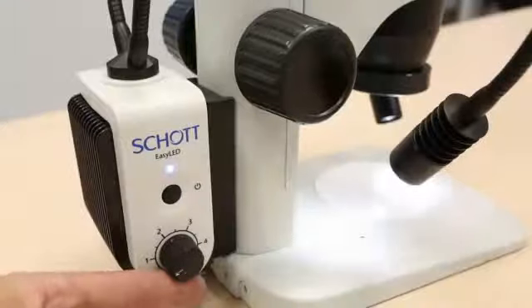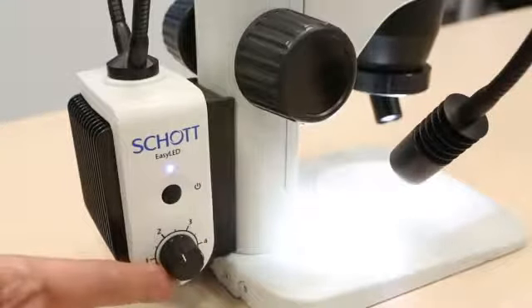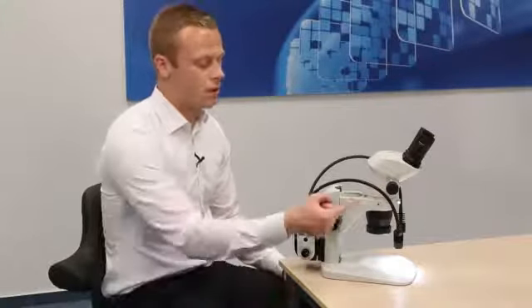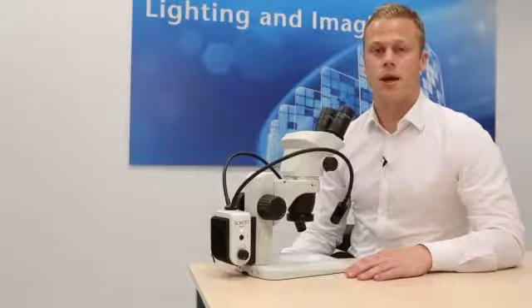You may adjust the brightness anywhere between a scale of 0 to 5, with 5 being the maximum intensity level at up to 140 lumens per head, as you can see here via the flexible gooseneck. Now I'm going to demonstrate how to use this device in your working conditions. It's very easy to manage.